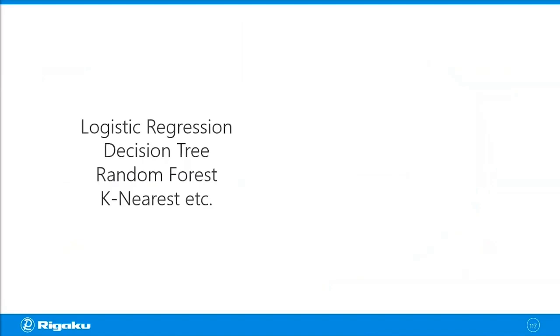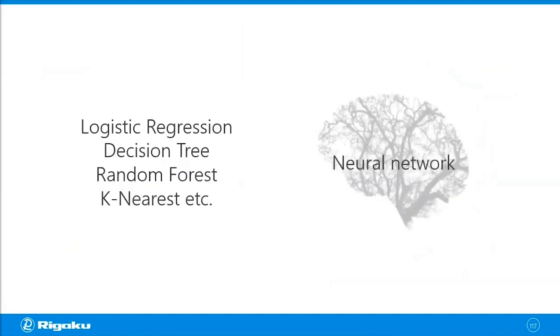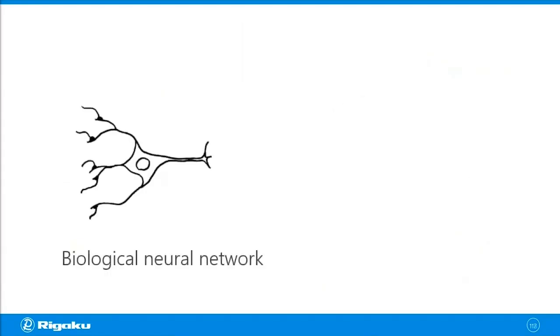When people say that they used deep learning for image recognition or segmentation, they usually mean that they used a neural network. And when you hear the term neural network, you might think of a biological neural network. We all have one. We take an input, like looking at somebody's face, and I say, oh, that's George, that's the output.